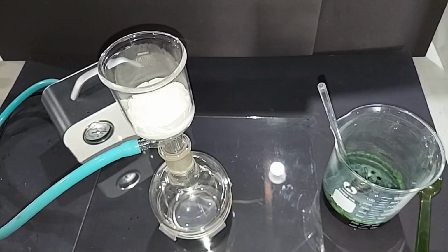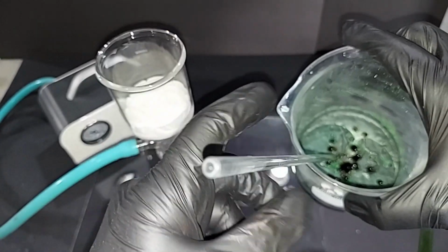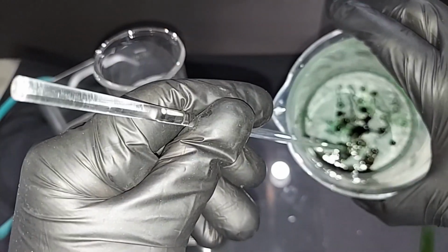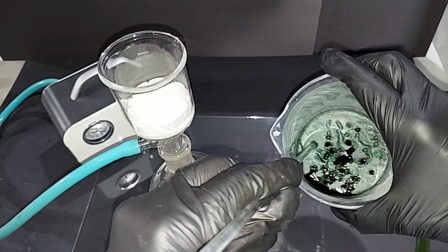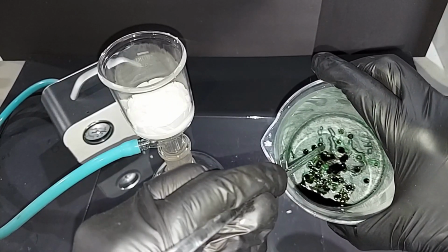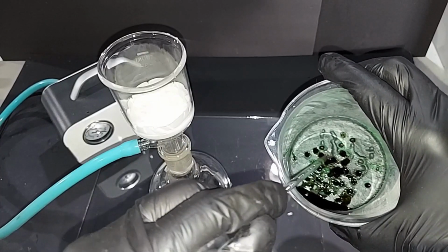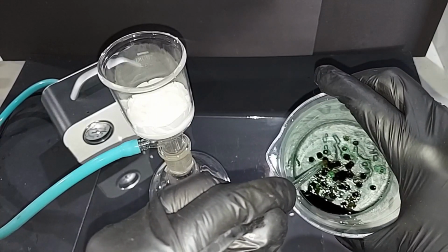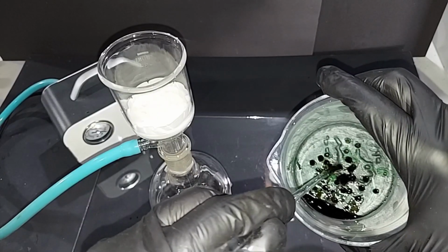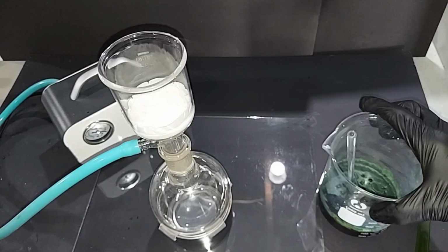Finally, we're here where we can actually filter this stuff. It took a bit to get here. I want to make one quick comment, and that is, breaking this up again a little bit here. You can see that this is definitely green. It's not that, I don't know, call it motor oil color. And so the effort of putting a lot of water in here and then dehydrating it definitely was important, because we finally have copper 2 chloride pretty much alone in here. Probably 99% of this is copper 2 chloride. So in spite of all that extra work, it was definitely worth it.